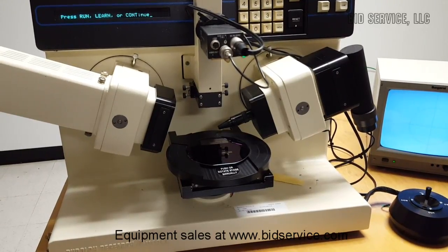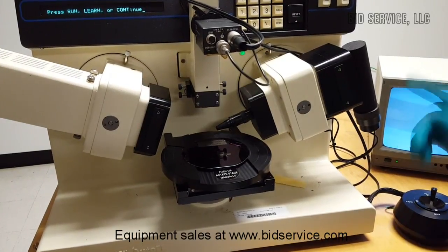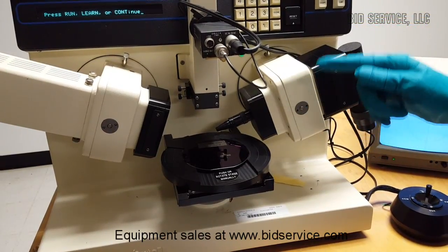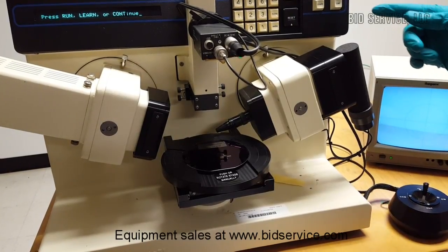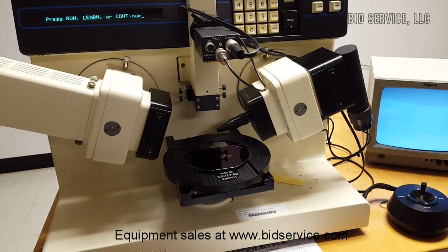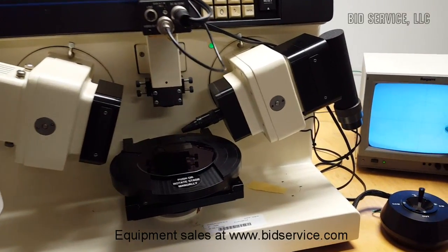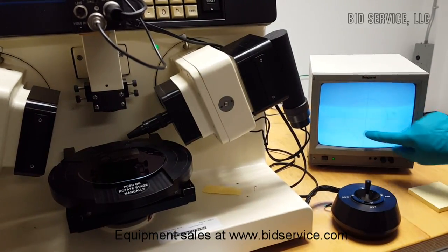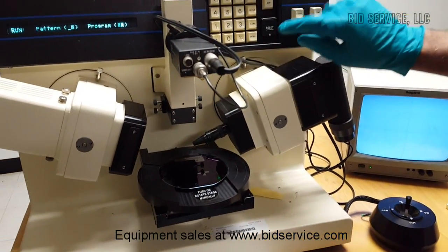Otherwise, there is a formula to calculate the thickness, but if we enter the rough thickness of the sample, then the system software will evaluate the order thickness and give you the exact thickness measurement, which I will demonstrate also here. So this is the crosshair, which is visible with the circle. Right now the sample is not in the beam path, so we don't see the dot in the center. So I'm ready to operate the system, so let's proceed.